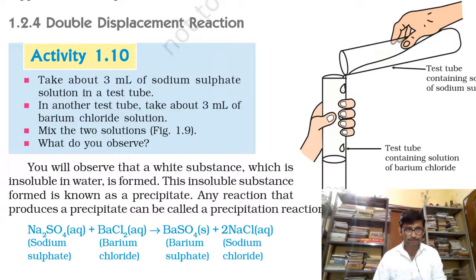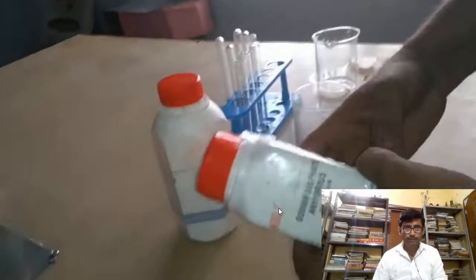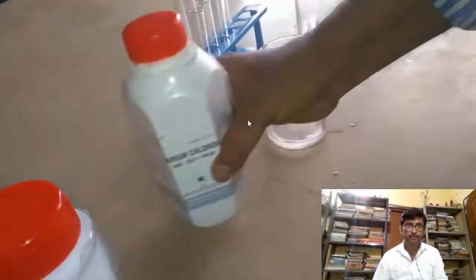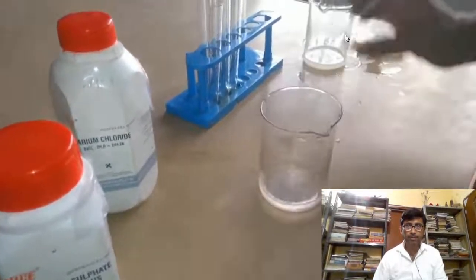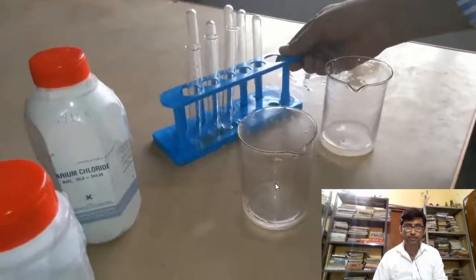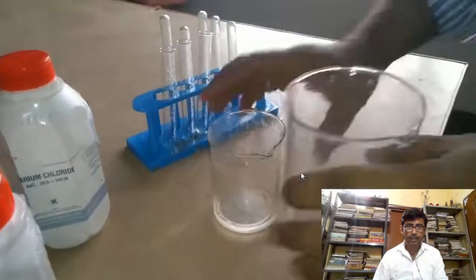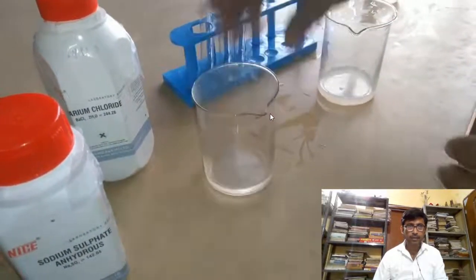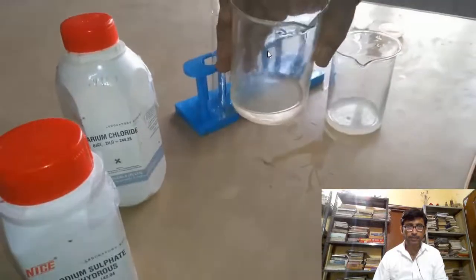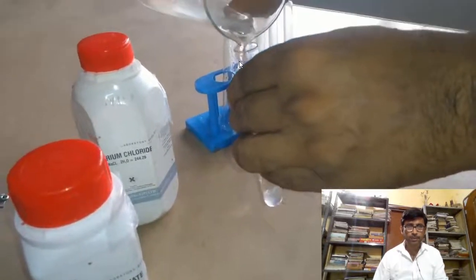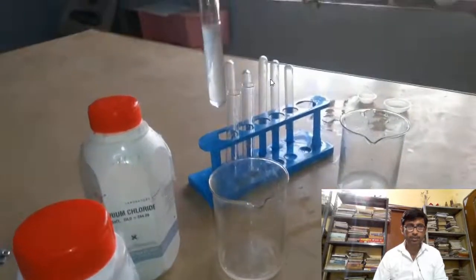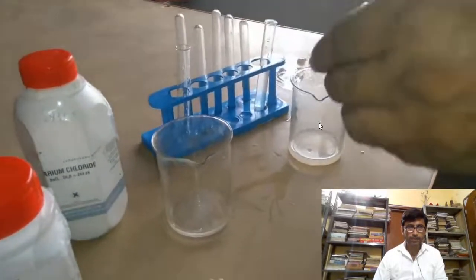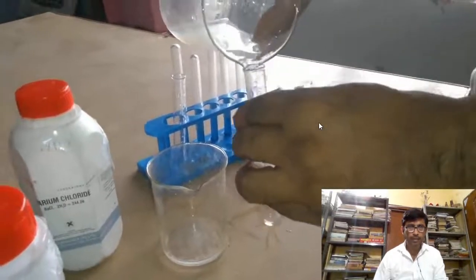Here we have sodium sulphate and barium chloride — a solution of each. We are going to pour these solutions into two different test tubes, because it will be easier to perform the experiment using test tubes. So we are pouring both solutions into two test tubes, one solution in each.